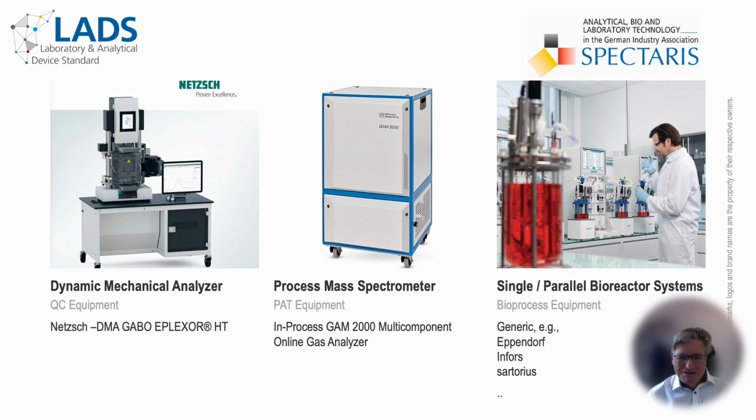Sometimes even we are surprised by the wide variety of laboratory equipment. This happened to me when the company Netzsch asked us to create a LADS information model for a dynamic mechanical analyzer, as shown on the left-hand side. To our delight, LADS proved to be capable of handling this specialized equipment as well.